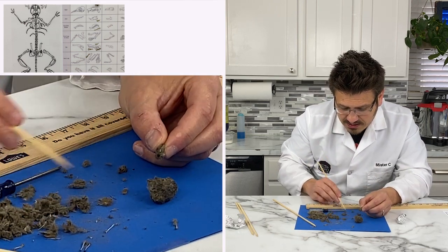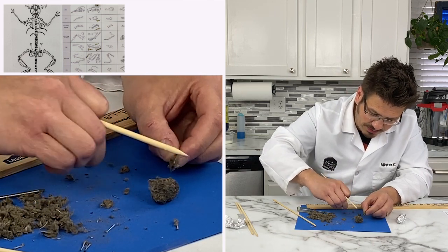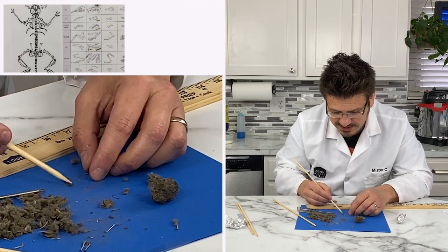Okay, we're making a big mess. There are tons of rib bones in here. This is where a pair of tweezers would be really helpful, Mrs. C.